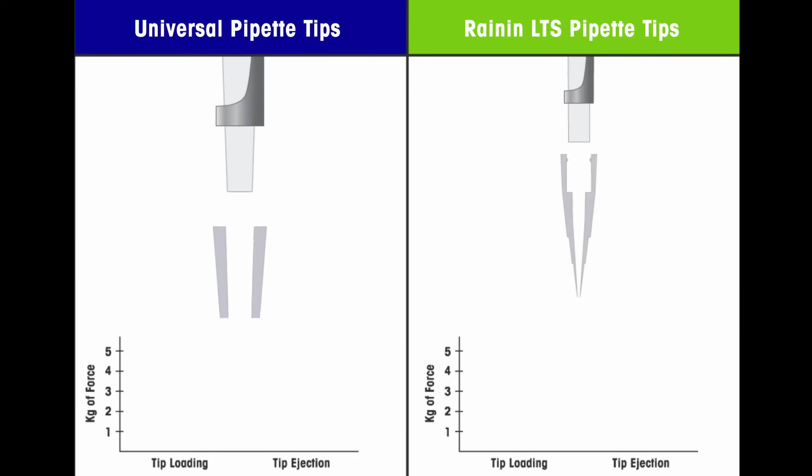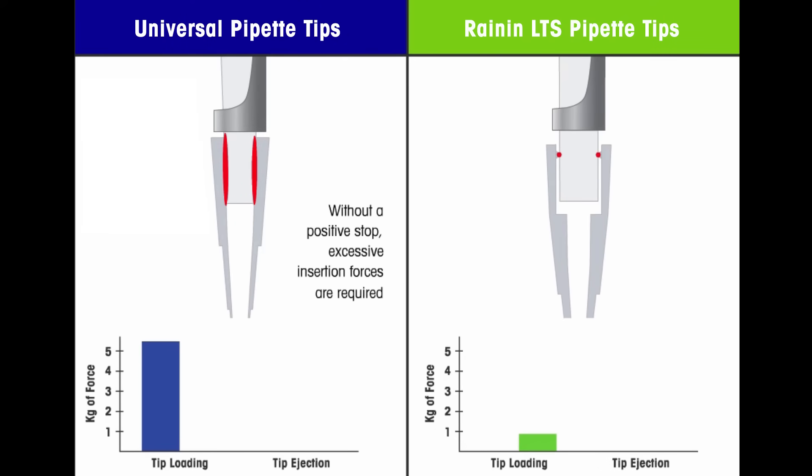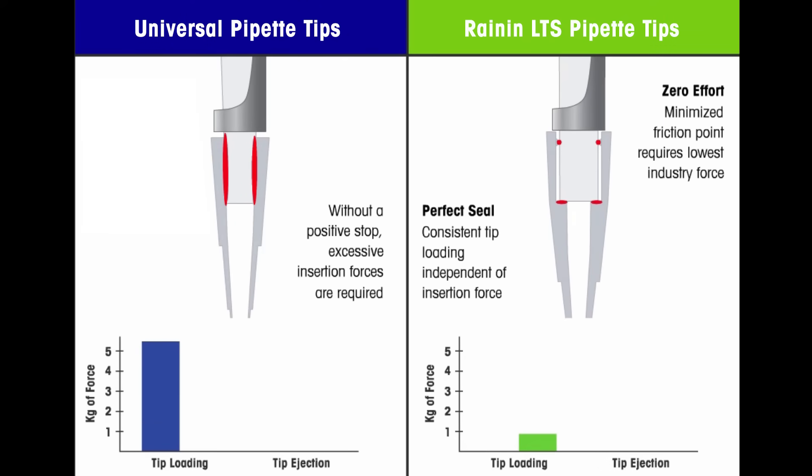Universal tips seal with friction down the sides of the cone-shaped nozzle. There is no moment when a seal is intact, so pipettes are often jammed forcefully into tips to ensure a seal. LTS tips seal with a small ring at the top, and the pipette just stops at a flat shelf inside the tip.